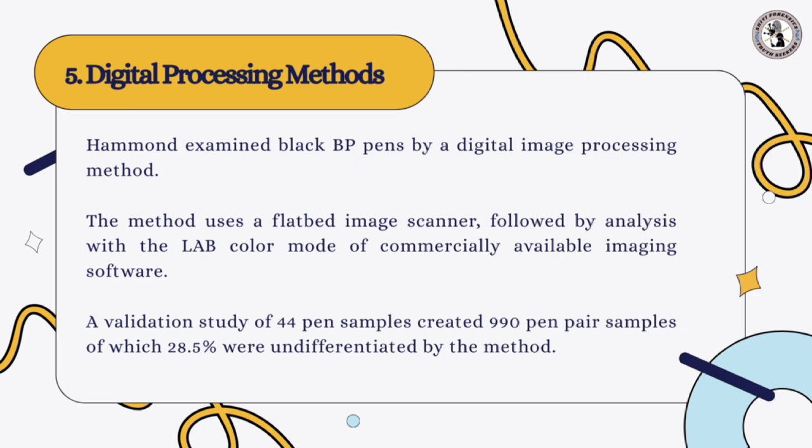A validation study of 44 pen samples was created, giving 990 pen pair samples, of which 28.5% were undifferentiated by the method.